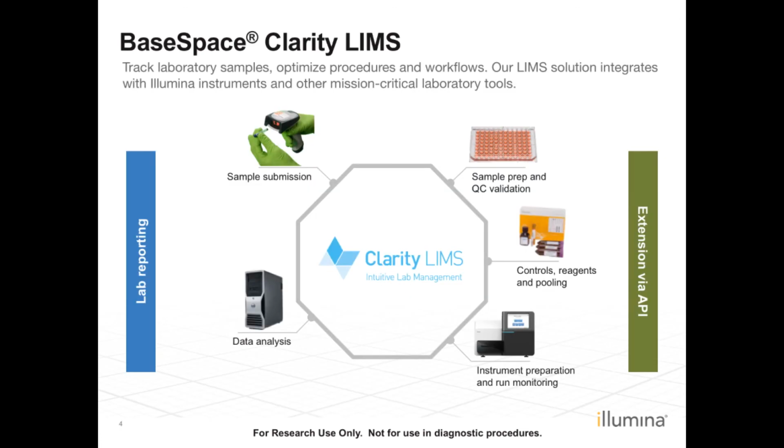In this introduction, we've talked not only about the core functionality of Clarity LIMS, from sample submission through instrument preparation, but we also spoke about pre-configured protocols and out-of-the-box integrations that help you get into production sooner, as well as the ability to extend the LIMS via the API or use our lab reporting module to really dig into those lab trends and analytics.